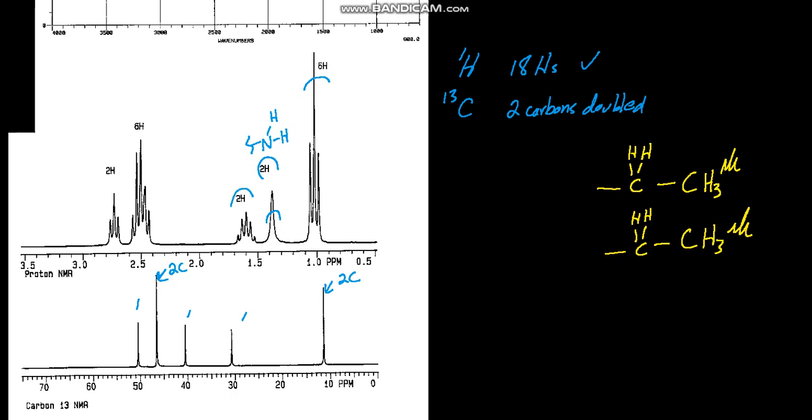Okay, so then there's a 2 hydrogen highly split signal. 1, 2, 3, 4, 5. So it's a pentet. There's a 2 hydrogen triplet. Well, these can't be 2 hydrogen triplets. And then there's 6 hydrogens, so it looks like there's overlap here. So real data, hard to say what's what there yet.